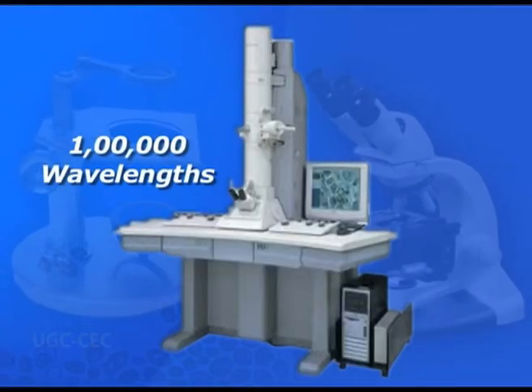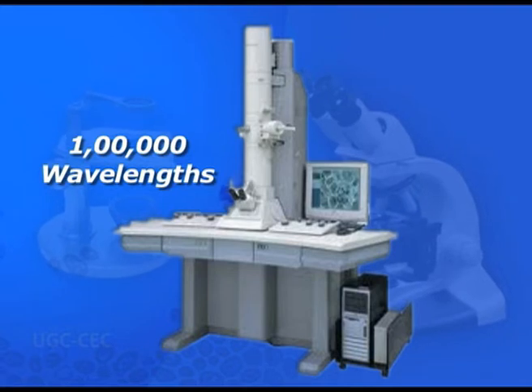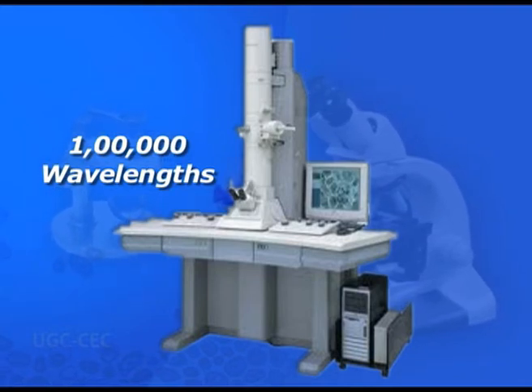Now, before going into the detail of the electron microscope, let's first define what an electron microscope is. An electron microscope is a microscope that uses an electron beam to illuminate the sample and produce a magnified image of the sample. An electron microscope has greater resolving power than a light microscope and can reveal the structures of smaller objects because electrons have wavelengths about 100,000 times shorter than visible light photons. They can achieve magnifications as surprising as 10 million x, while light microscopy can produce images of about 2000x. So you can imagine the difference between the magnification of a light microscope and an electron microscope.